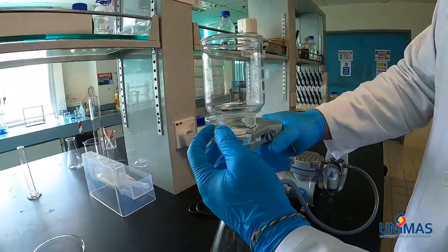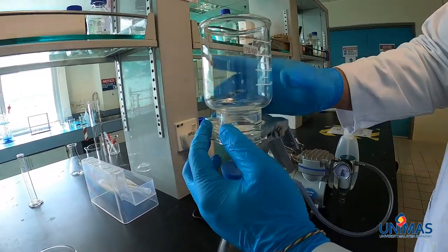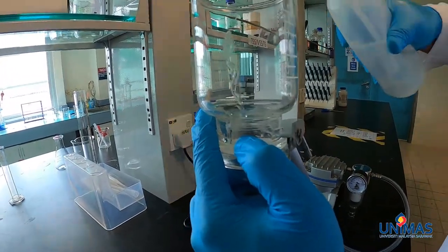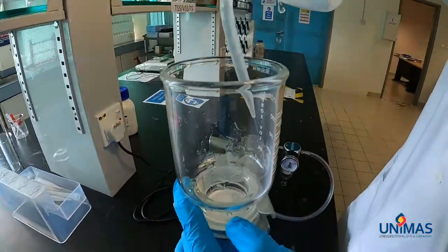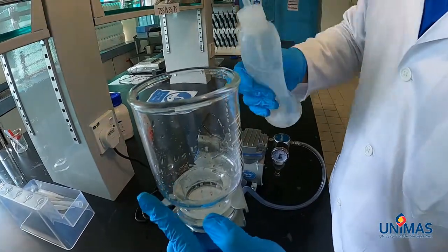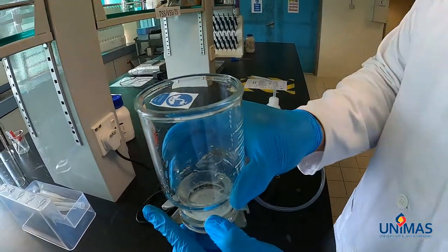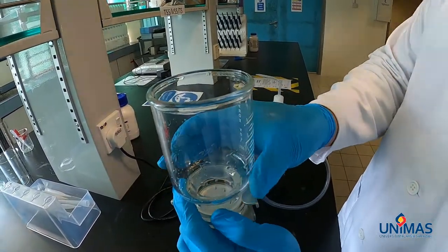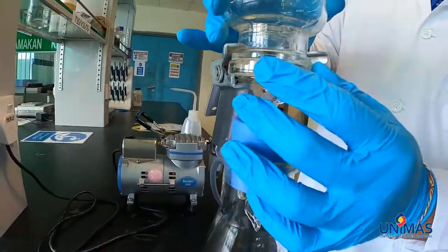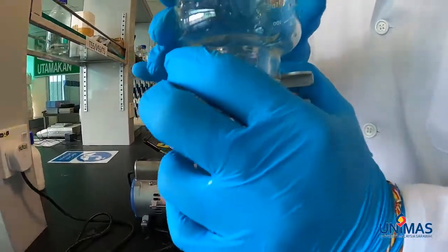We put the funnel on the disc and clamp it together, making sure it is holding well. After that, we need to rinse the wall of the funnel. Then we can turn on the vacuum pump to make sure that all the water is being sucked through. As you can see from the top, it's all dry.